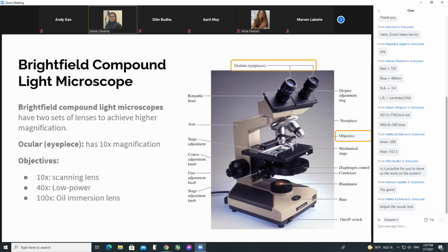Okay, so unless you go back and wipe everything down, using special wiping paper and sometimes ethanol. And so with the oil immersion, once you've applied oil onto a slide, you really can't use it under 10x and 40x. So we're going to have to use it directly under oil, which can get very tricky to find the image, right?